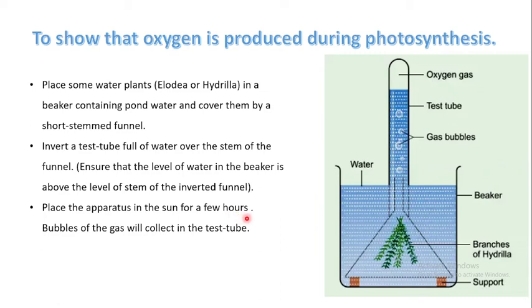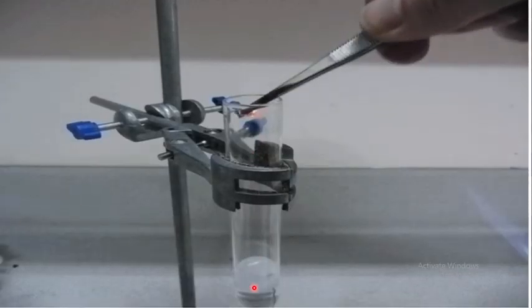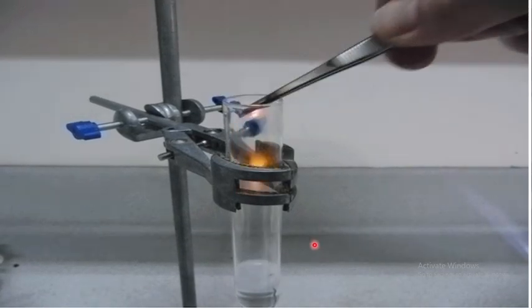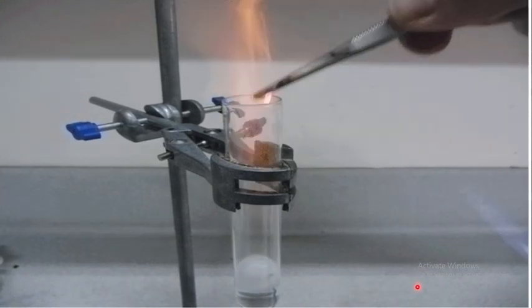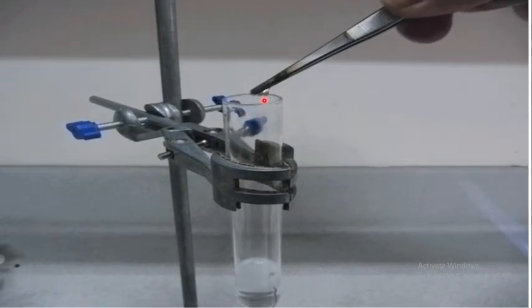Place the apparatus in the sun for a few hours. Bubbles of gas will arise and collect in the test tube, pushing the water down. To test the gas, bring a glowing splinter close to the test tube — the splinter bursts into flame, confirming the presence of oxygen. This shows that oxygen is produced as a product during photosynthesis.